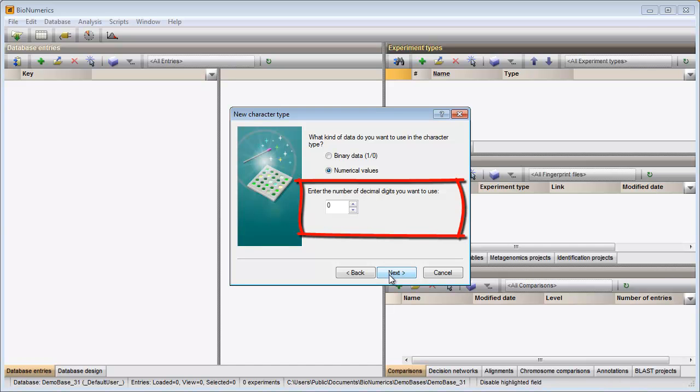Since all my values are integers, I do not need to alter the second setting and I can go to the last step.